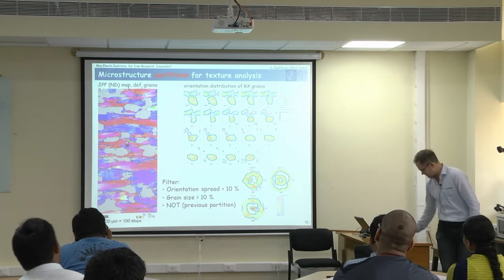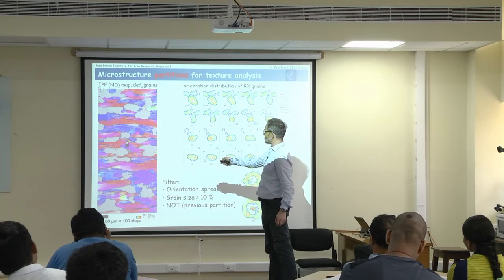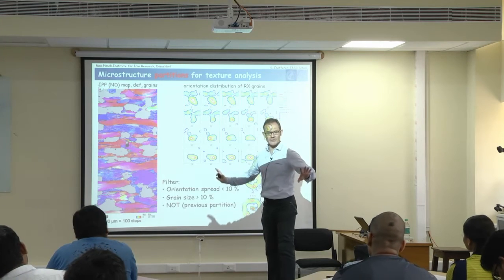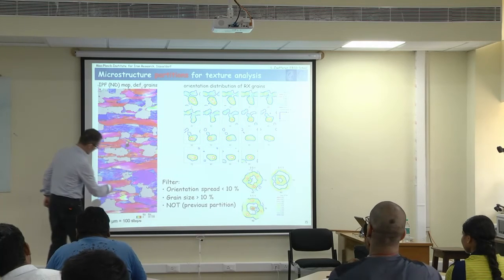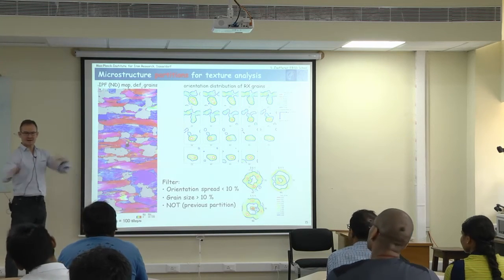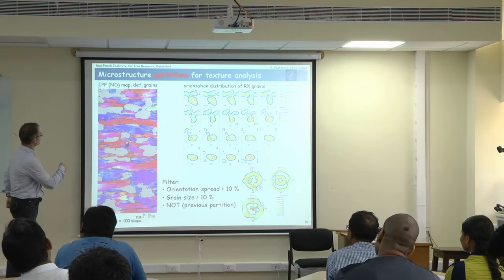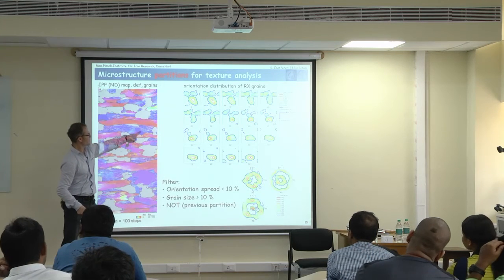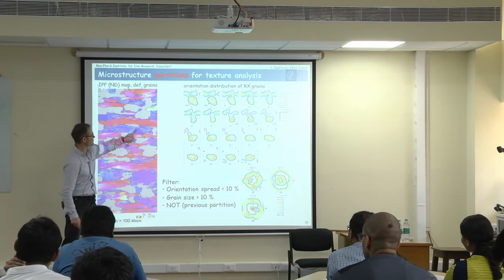There's a little bit of debris. This grain here, for example, has obviously been wrongly defined. This one here as well, but we can tolerate a few grains. This grain here also, this grain here also. I could go by hand and kick them out as well because I want more accurate data. This one seems also not to be good. Why has it been included? Because there was no 5-degree misorientation boundary, so it was considered to belong to this one here.